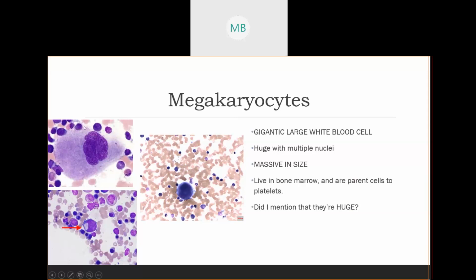Look at this. Compare these lymphocytes around here to this one massive, big megakaryocyte. Do you see the size difference in a red blood cell, a lymphocyte, and this massive megakaryocyte? Do y'all see that difference? I hope you see that difference.